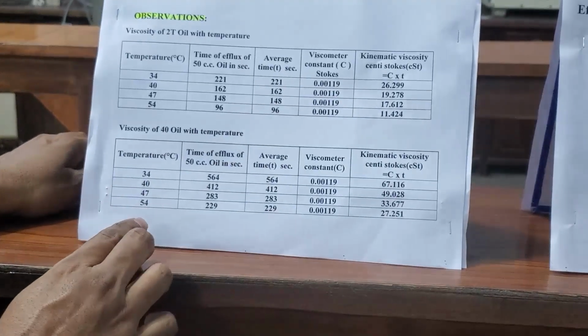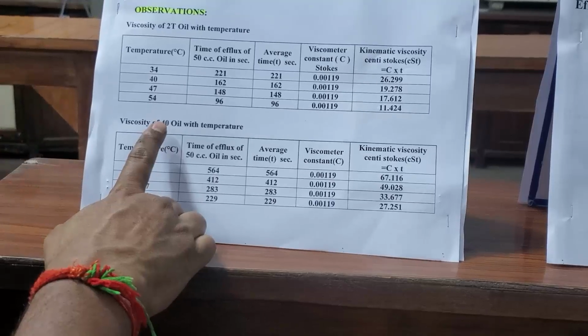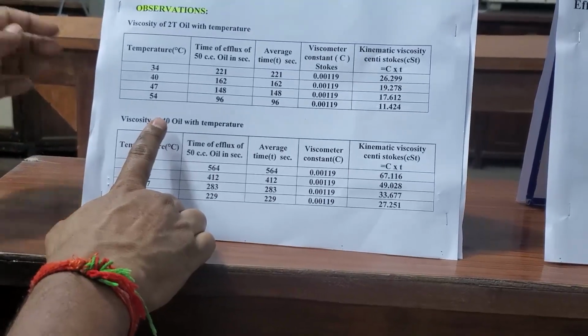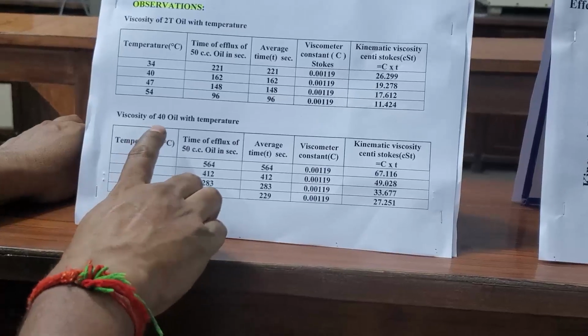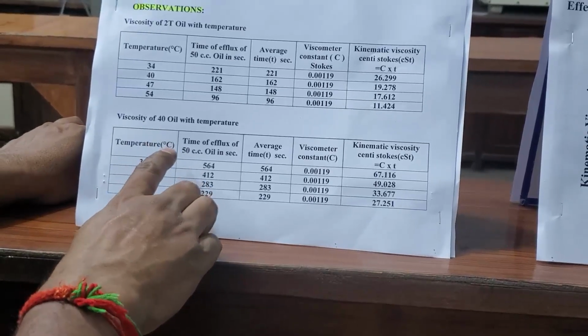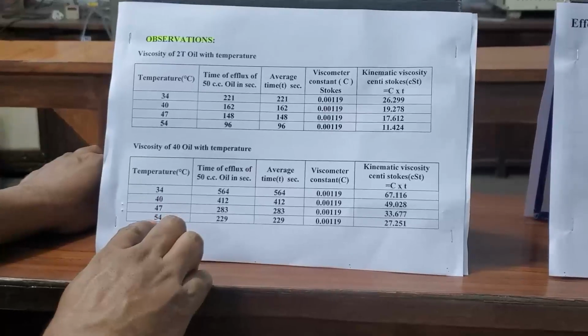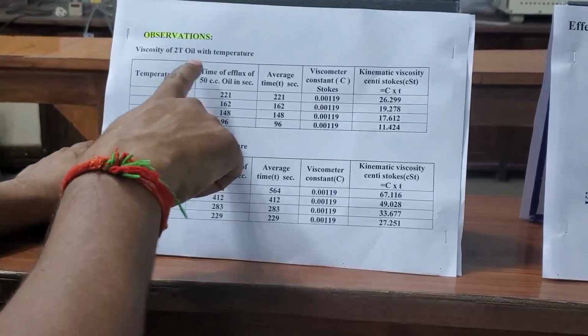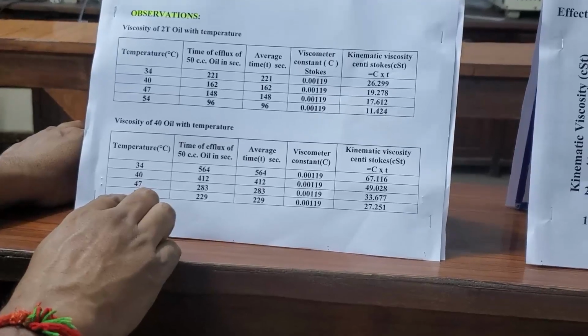Here also we took 40 oil, that is 15W40 car engine oil. This oil is also tested at different temperatures. The same temperatures we used for the 2T oil, we repeated for this oil also.